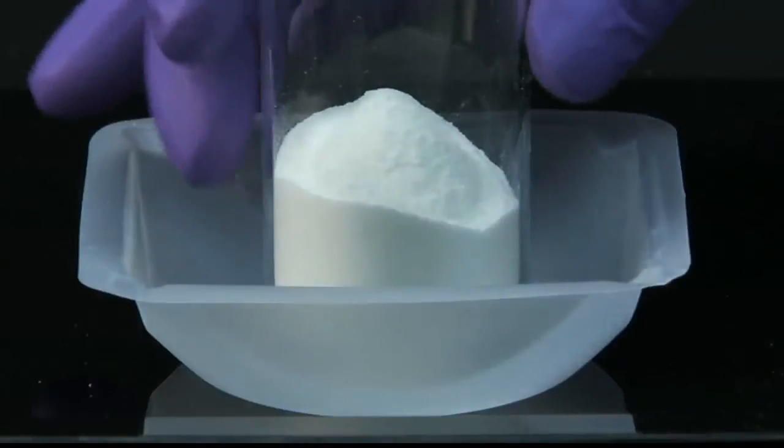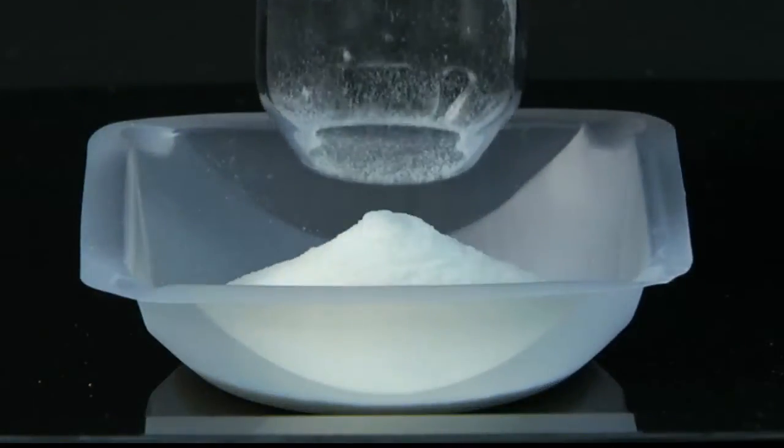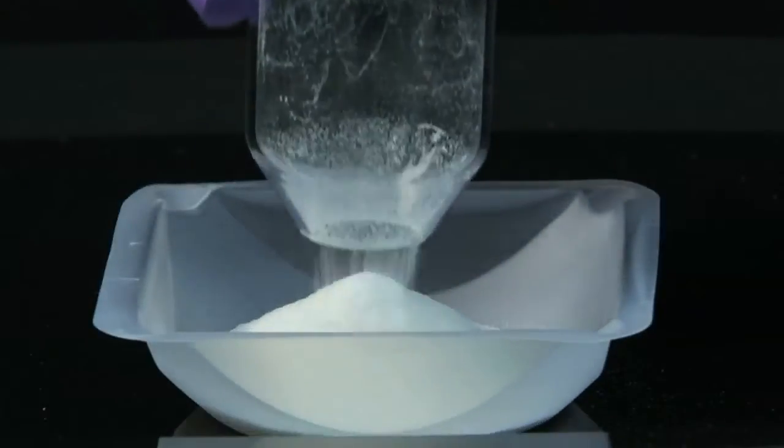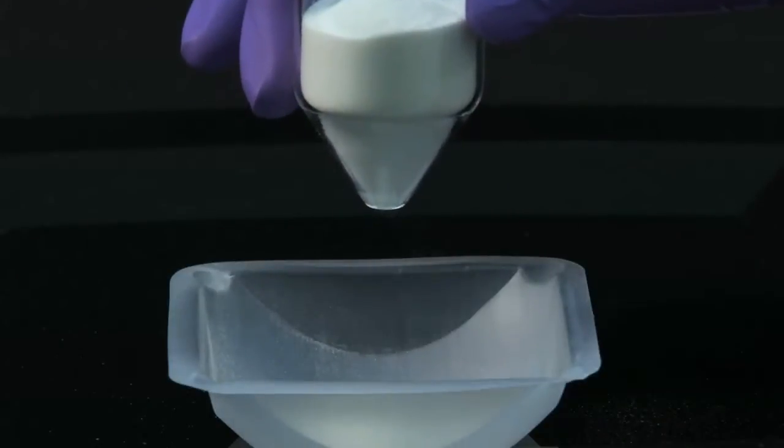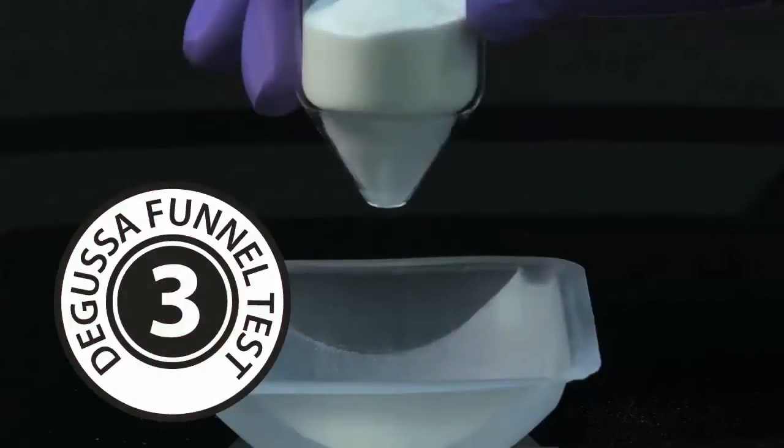This Hypermelos flows freely through cylinders 6, 5, 4, and 3, but stops flowing at cylinder 2. The test protocol assigns this grade of Benicel Hypermelos a score of 3, the last cylinder through which it flowed freely.